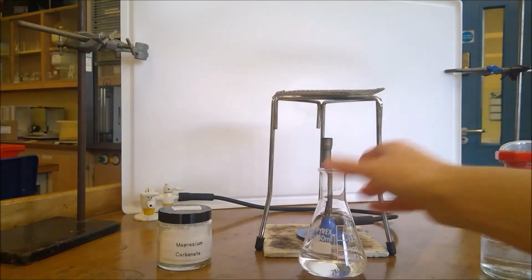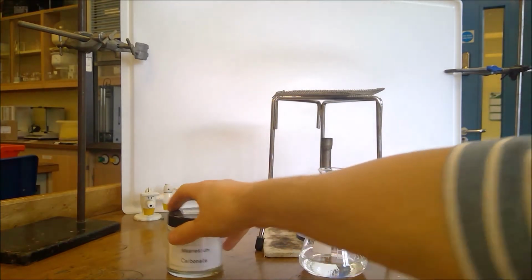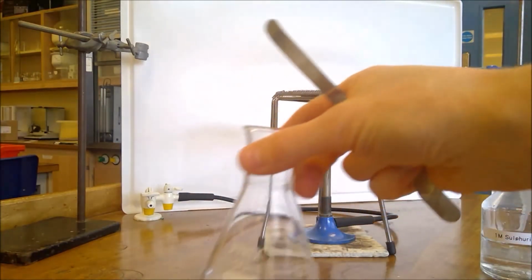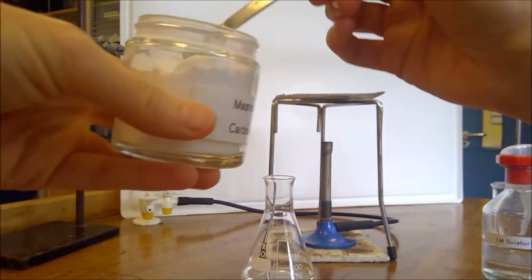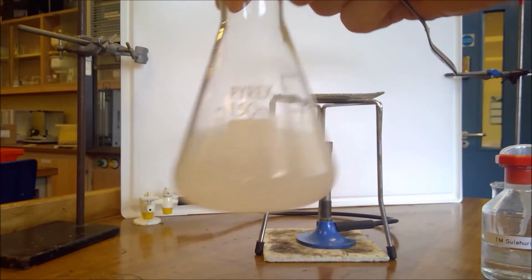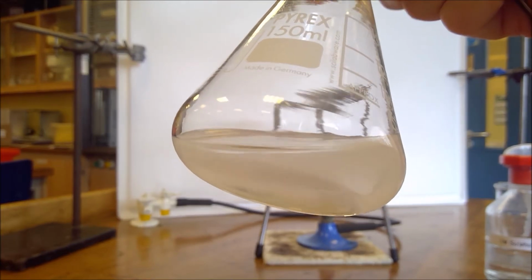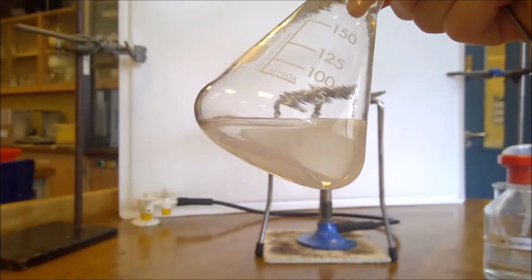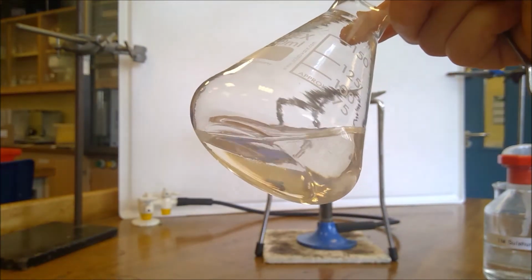and then to our acid we need to add portions of magnesium carbonate and make an observation of what is going on. So I will take my magnesium carbonate here and put a spatula of the magnesium carbonate into my sulfuric acid. So we'll swirl that around. You might possibly be able to make out a few bubbles here and there, which is what we expect when a carbonate is going to react with an acid. So that's our carbon dioxide being formed. So slowly the reaction is then happening.